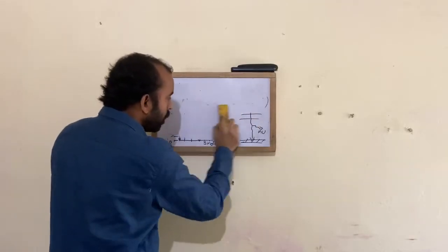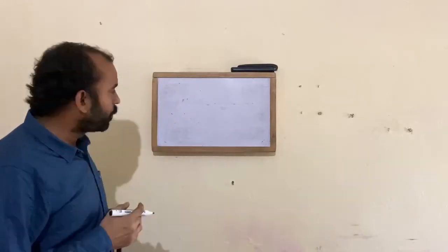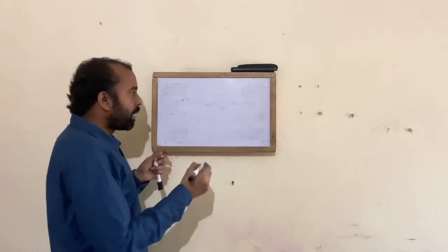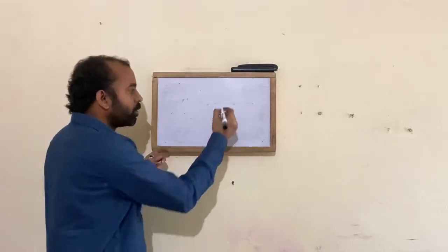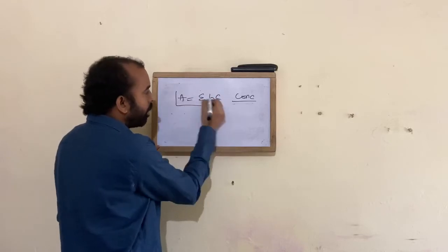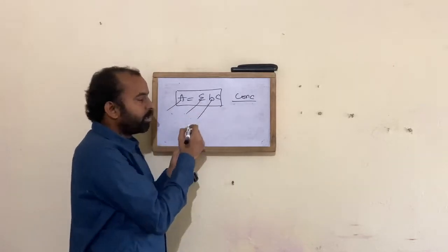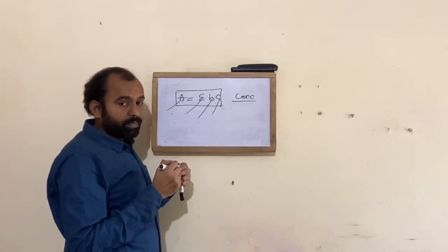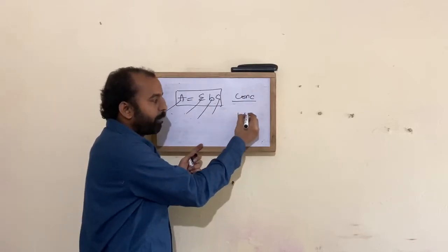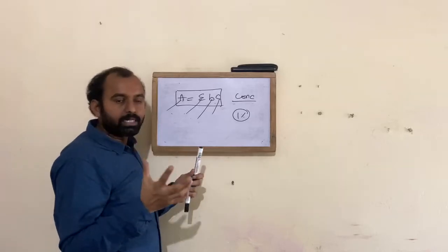Now let us see, in comparison with UV, fluorescence spectroscopy is also very similar to UV spectroscopy. In the UV, we have already learned that Beer-Lambert's law is not applicable for concentrated solutions. That is A = εbc. This is the fundamental of Beer-Lambert's law in ultraviolet spectroscopy, where A is the absorbance, ε is the molar absorptivity, b is the path length, and c is the concentration. Here, what exactly I am going to tell you is that it is concentration dependent. All the solutions should be less than 1%. Solutions whose concentration is more than 1% will deviate from Beer-Lambert's law. That is the UV fundamental.